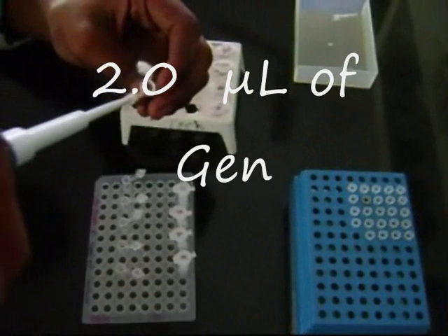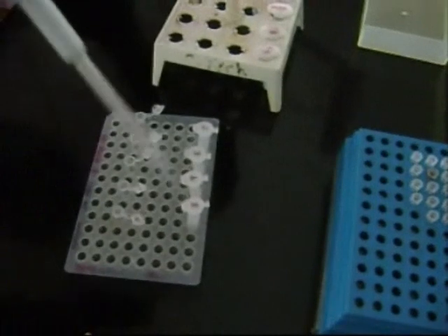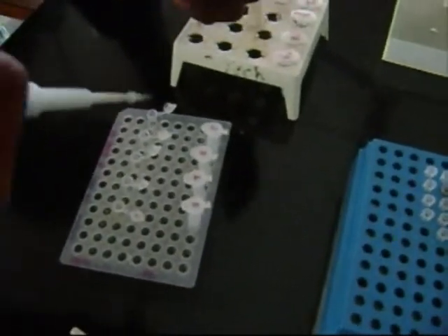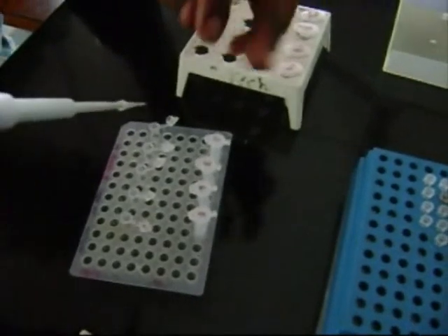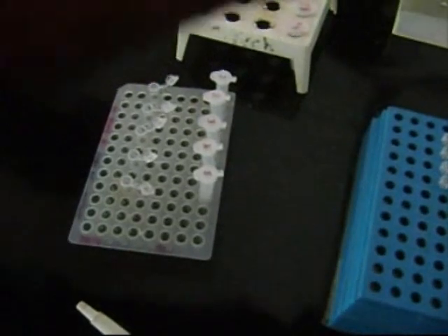2 microliter of genomic DNA samples is added to the PCR tube. They act as the template for further amplification. These genomic DNAs differ in the number and position of repeats in them, and thus help in finding the polymorphism.